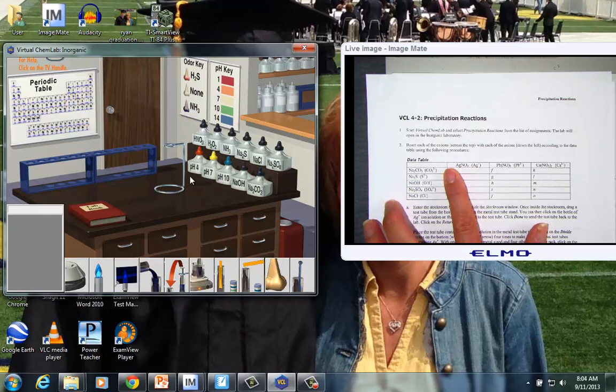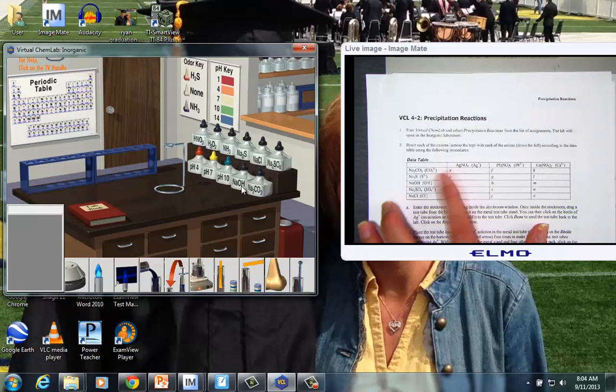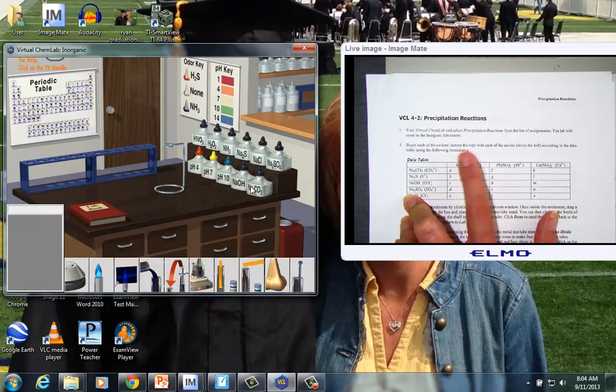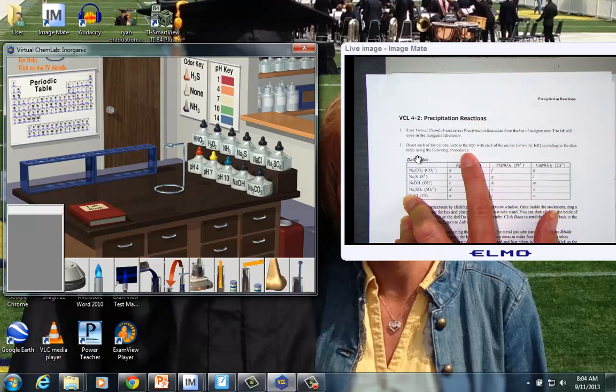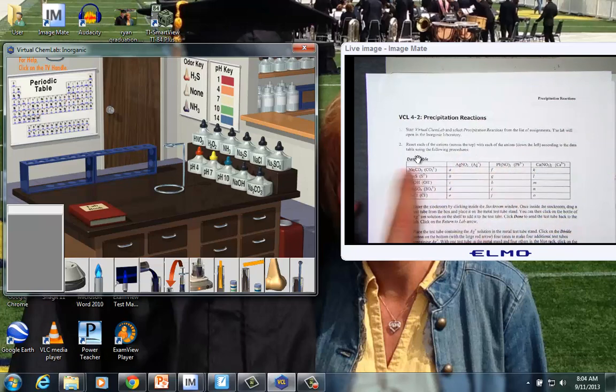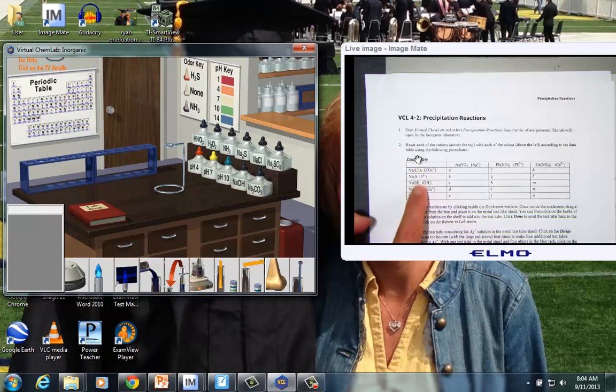Notice that we have some pH solutions, we have some acids, we have some bases, and we have some salts. What I want us to notice is we're being asked to react each of the cations across the top of our grid with the list of anions going down the grid.